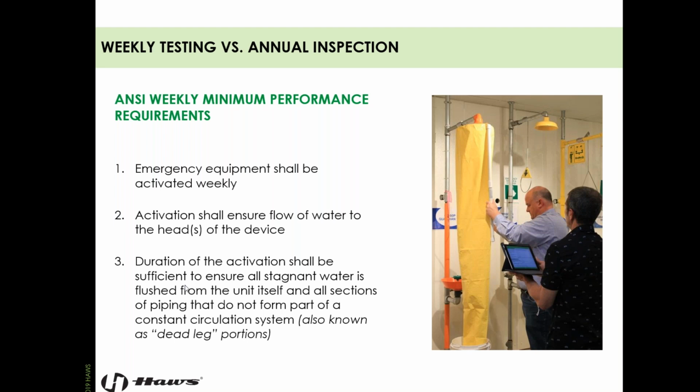So obviously different than plumbed equipment, but you just have to ensure that you have 15 minutes of water in the tank, whether it's plumbed, gravity fed or pressurized portable.